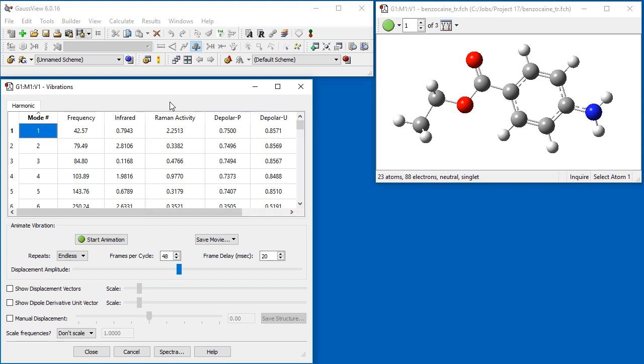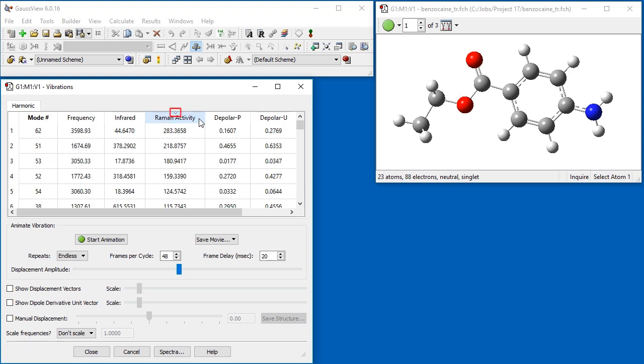We click on the Raman activity header, which sorts the modes accordingly, first in ascending order and then in descending order after a second click. The ordering is indicated by the direction of the arrow icon. The most active Raman modes are now at the top of the list.